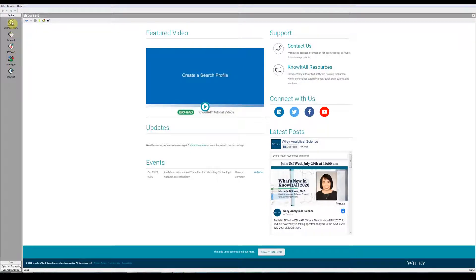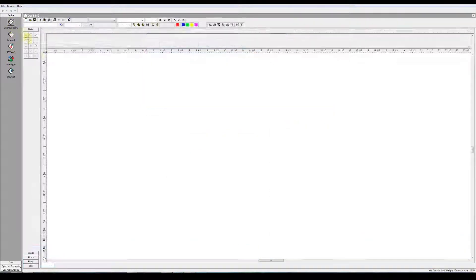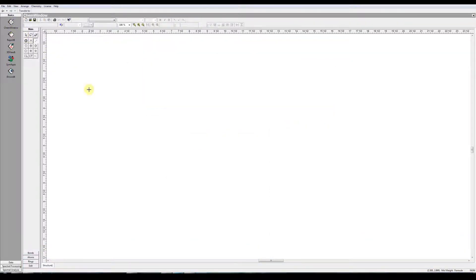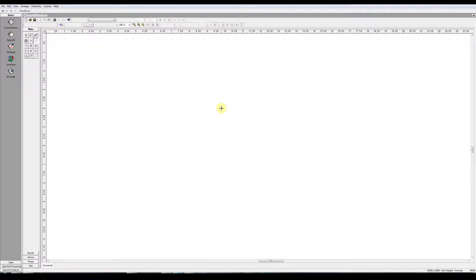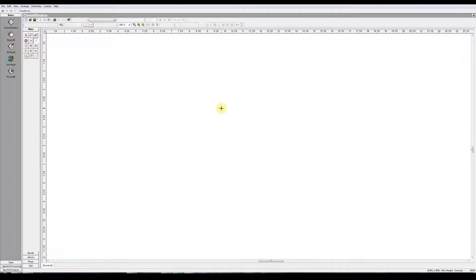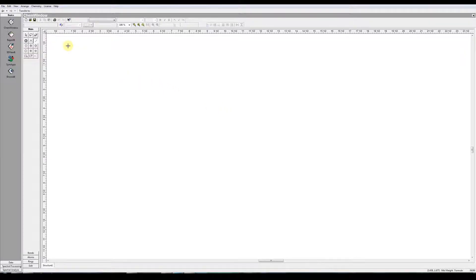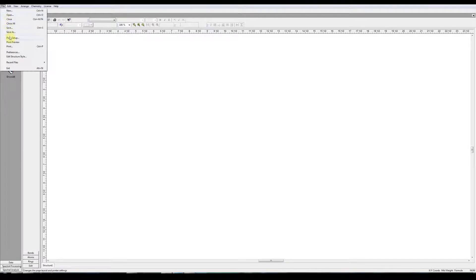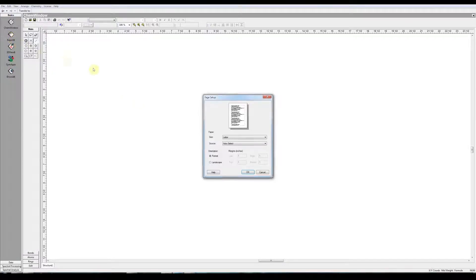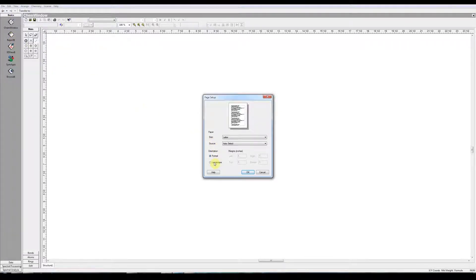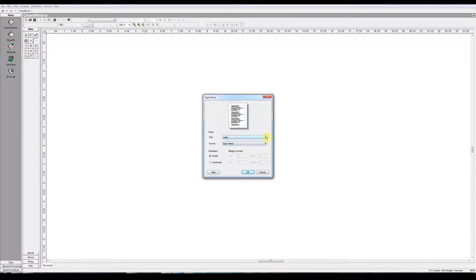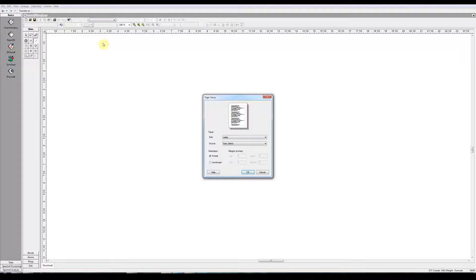Let's start in Cam Windows. So this is a canvas for drawing structures. There's a lot to tell you, but let me give you a general overview first. If you choose File, Page Setup, you have an option to choose Portrait or Landscape Layout and different sizes. I don't really understand the point of this because the canvas is absolutely huge, as I'll show you in just a minute.